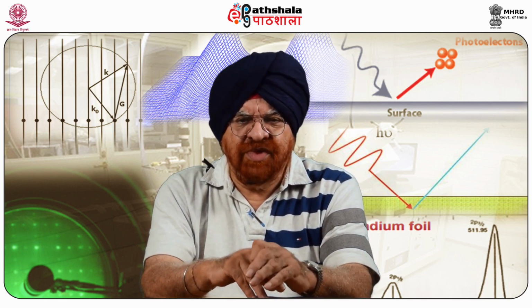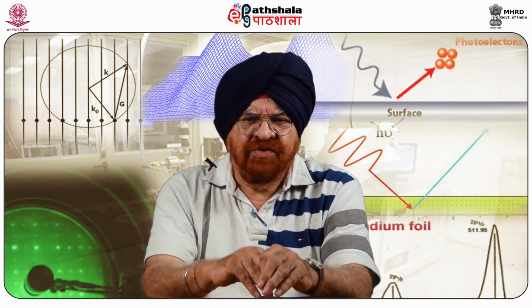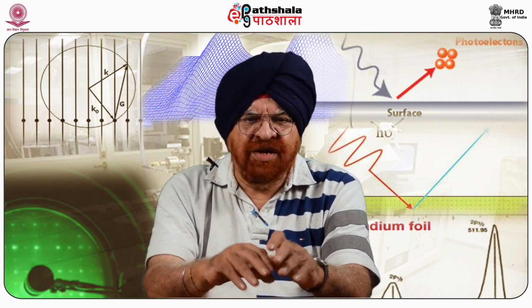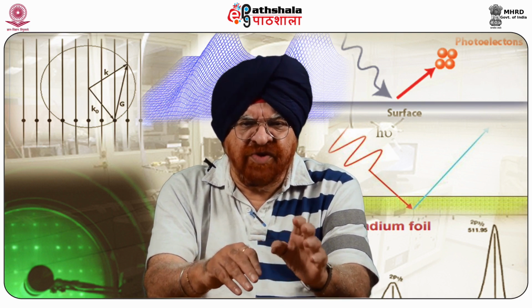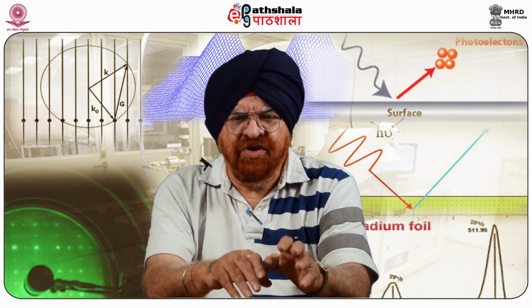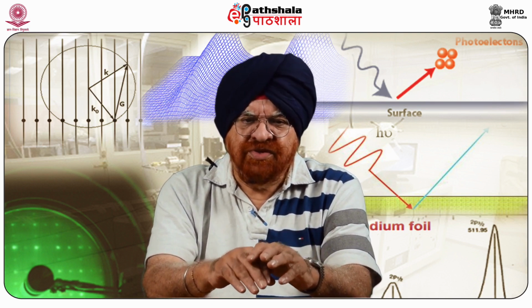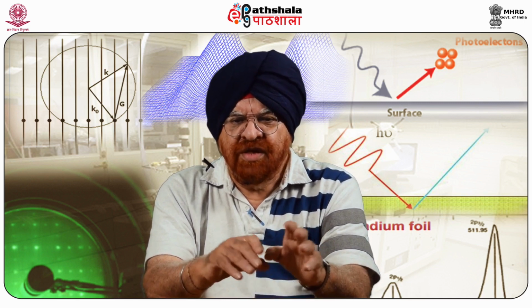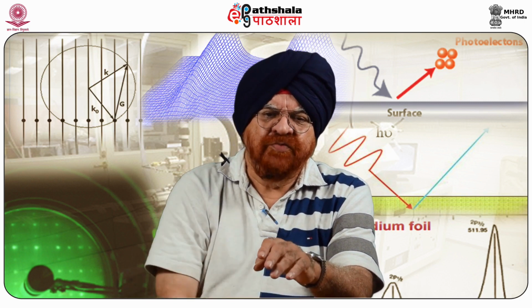In intermediate and non-contact mode AFM, the tip sample interaction is perturbed by attractive and repulsive forces, causing amplitude or frequency changes in the oscillation of the AFM tip. In AM mode, the amplitude modulated one, changes in the oscillation amplitude provide the feedback signal for the imaging, which is analyzed further.